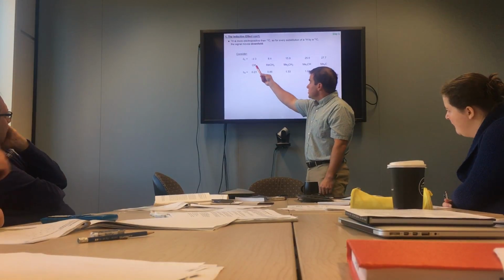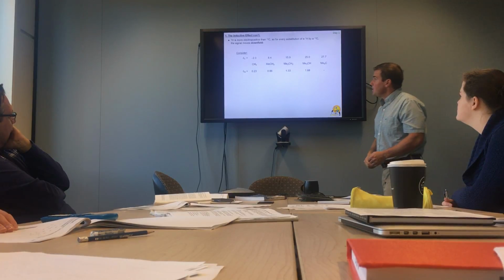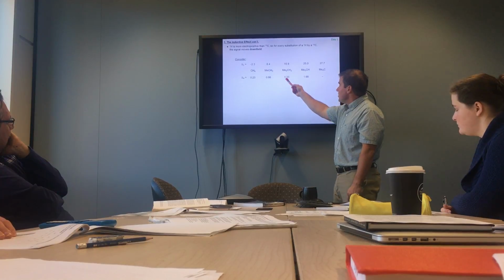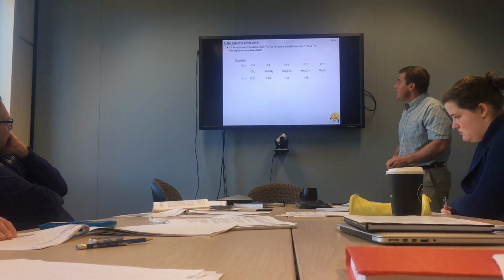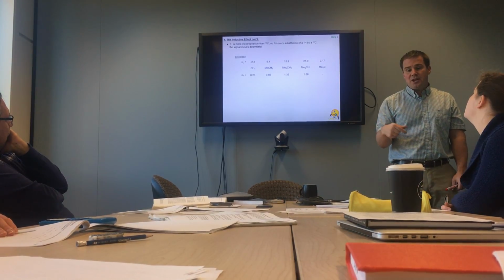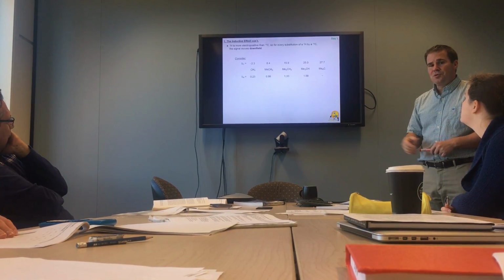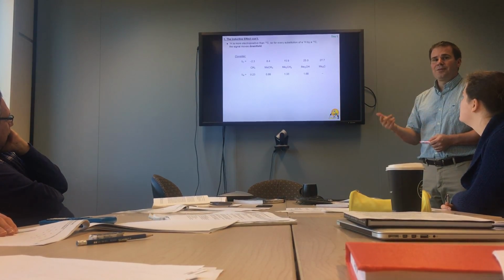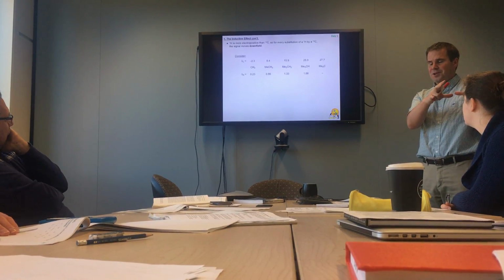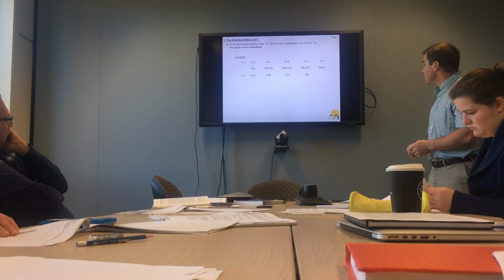So we start with methane, and a proton NMR is 0.23 parts per million. We replace one of those protons with a methyl group, we're down to about 0.8. Replace another proton with a methyl group, down about 1.33, and we replace another one, we get to 1.68. So in other words, every proton that we exchange for an alkyl group, we move downfield by about 0.2 or 0.3 parts per million. Another really good thing to keep in mind when you're thinking, well, I know what this NMR looks like for this molecule, I've made a perturbation, how much is that going to change the NMR? Useful to know.